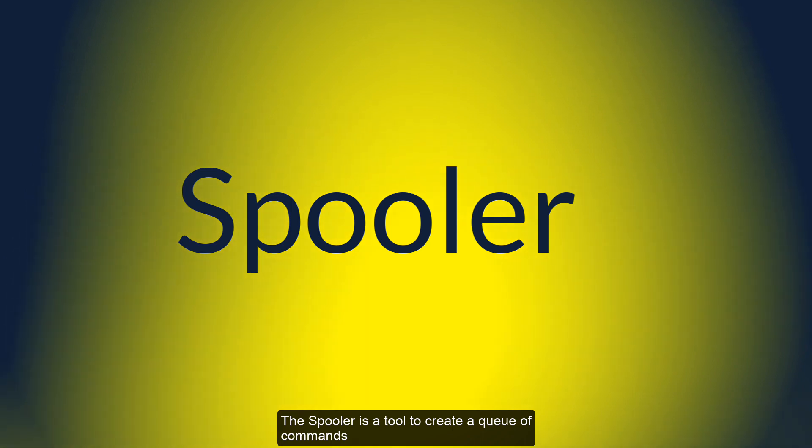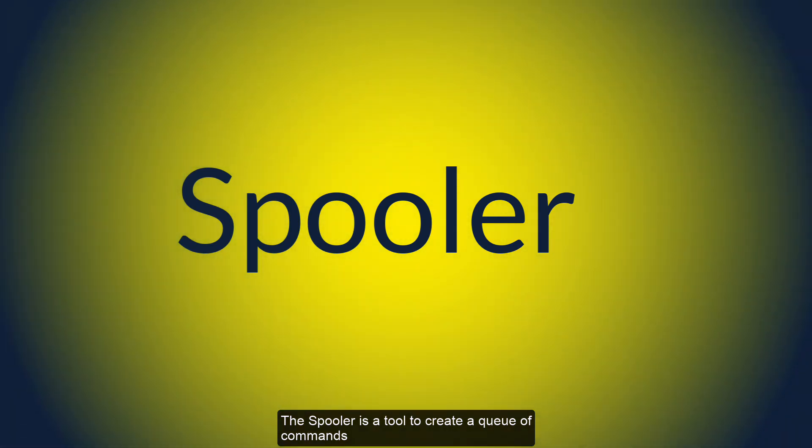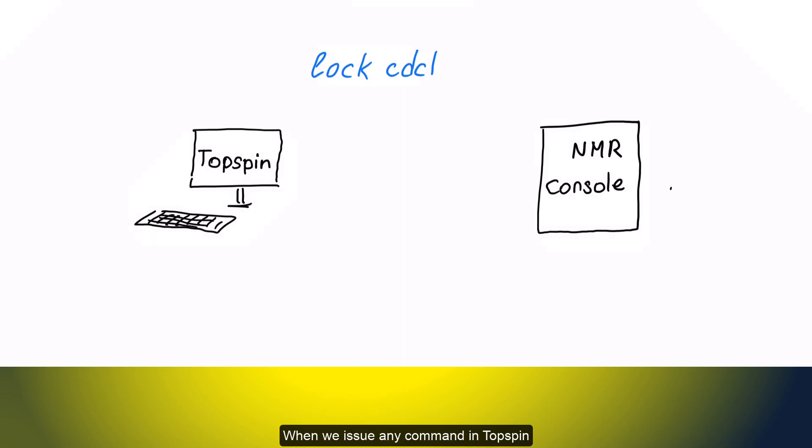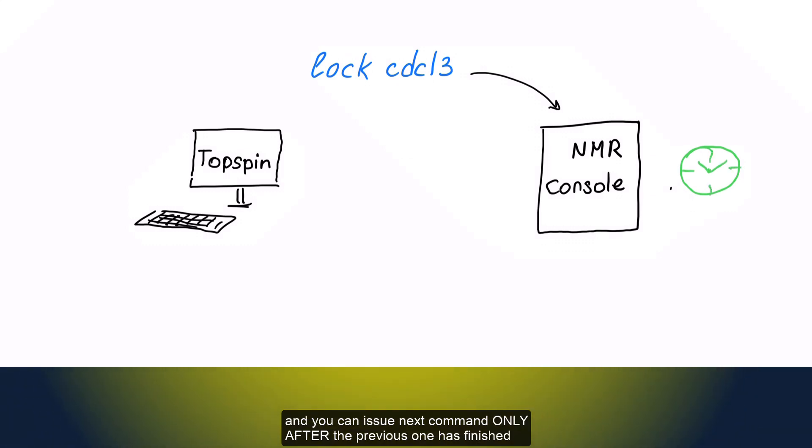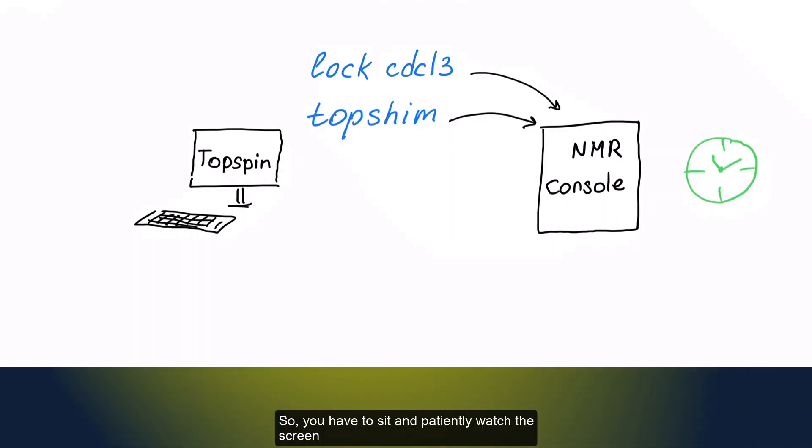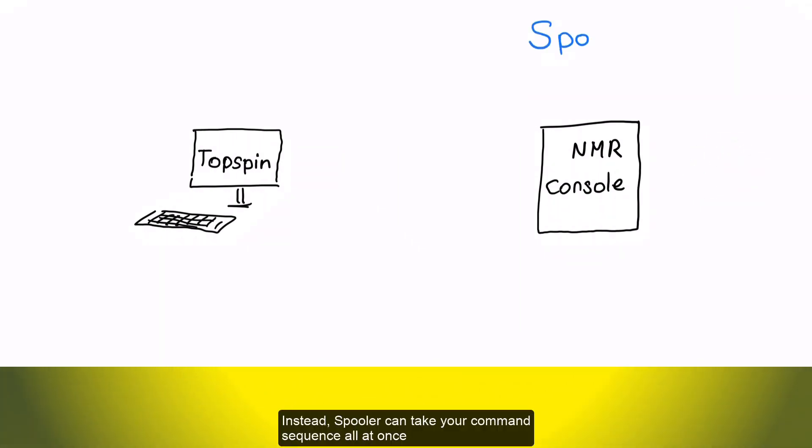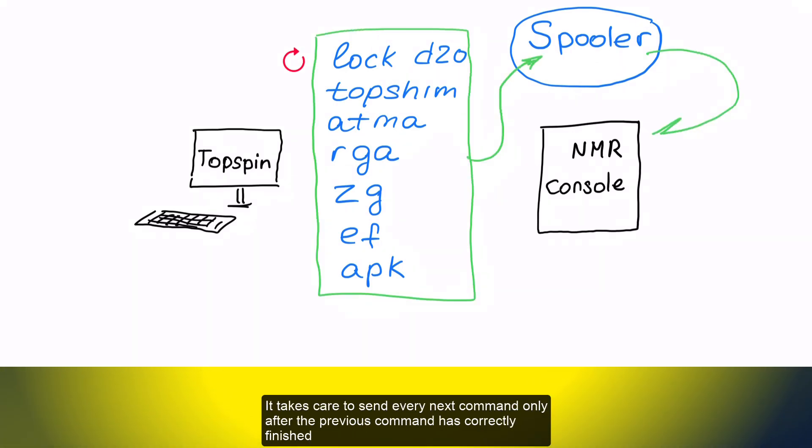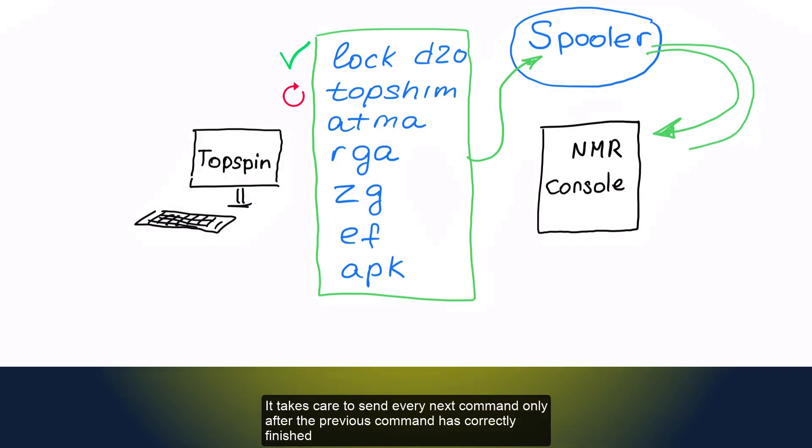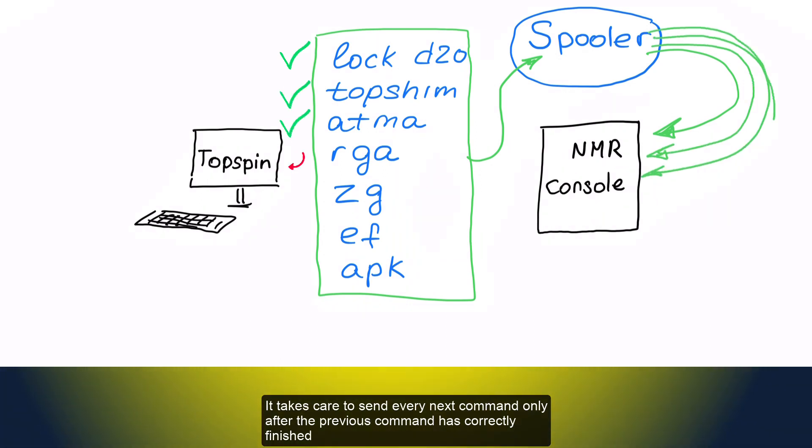The spooler is a tool to create a queue of commands. When we issue any command in Topspin, it is sent to NMR console directly. After it receives the command, it is busy for some period of time, and you can issue next command only after the previous one has finished. So you have to sit and patiently watch the screen. Instead, a spooler can take your command sequence all at once and submit your commands to the console one by one. It takes care to send every next command only after the previous command has correctly finished.